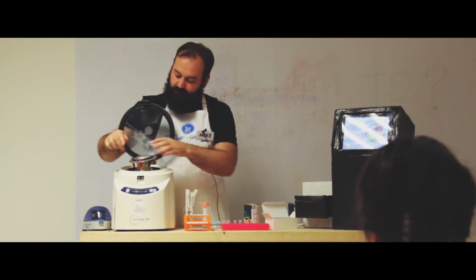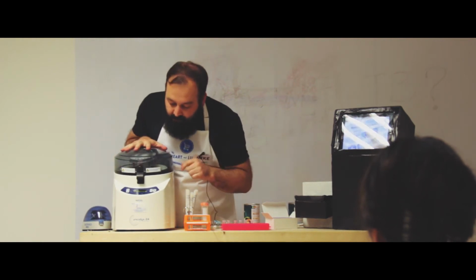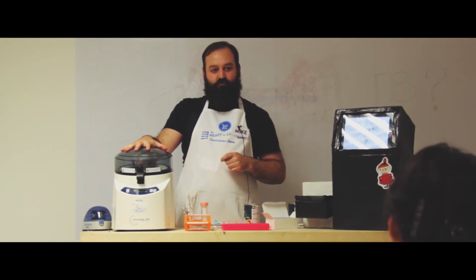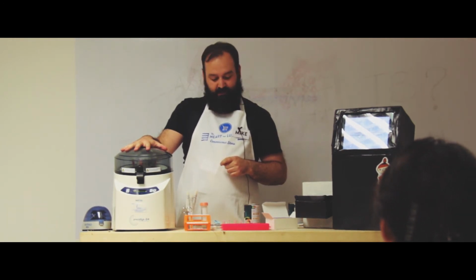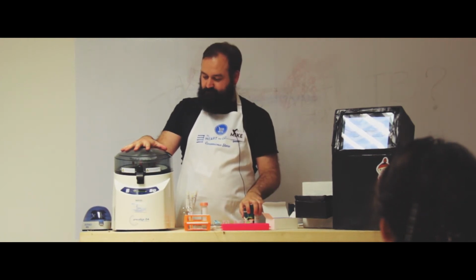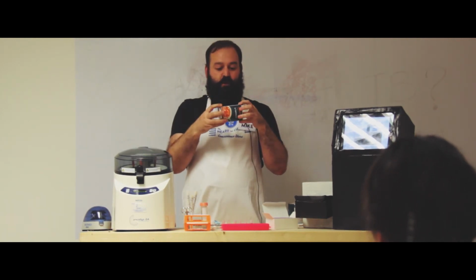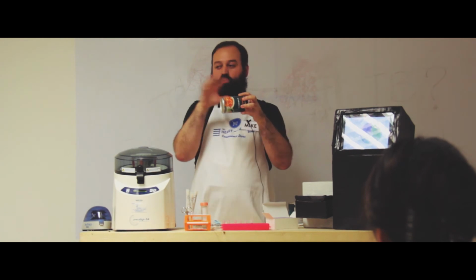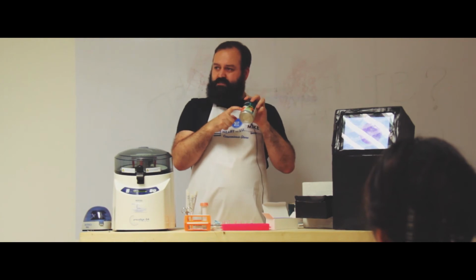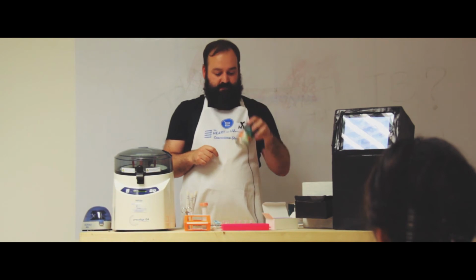So there's our sample. And here's the bead beater. It's a bit like a blender. And I'm going to set it off. It really violently shakes the sample around, and that's cracking open this tin. So now what we've got is a big soup in there of bits of the tin, all the veggies and the pasta shells, and then the soup itself. What we want is the DNA, which is just the pasta shell. So we've got to get rid of all this other rubbish that's in there.